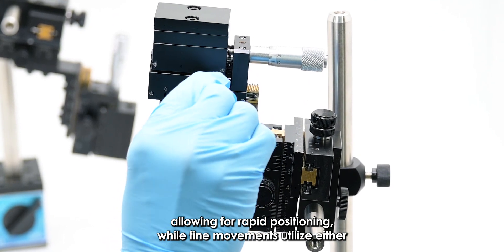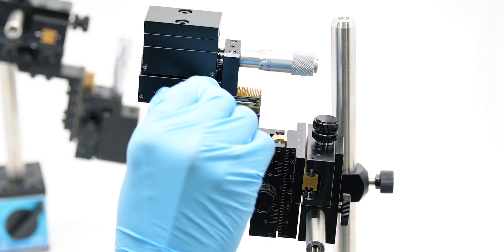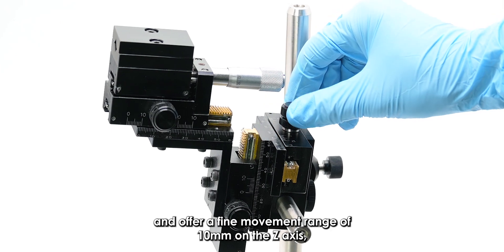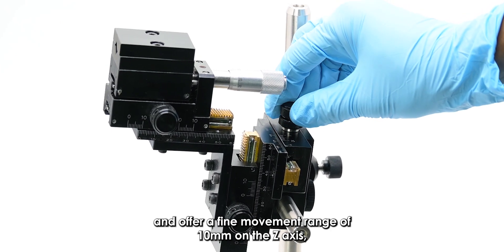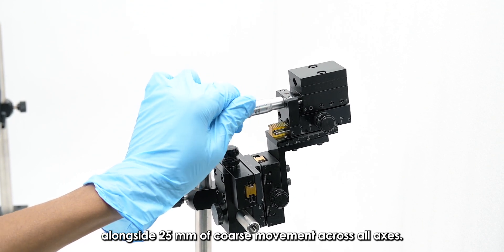Fine movements utilize either a micrometer or a fine-pitched lead screw for enhanced control. The manipulators can support probes up to 8mm in diameter and offer a fine movement range of 10mm on the Z-axis, alongside 25mm of coarse movement across all axes.